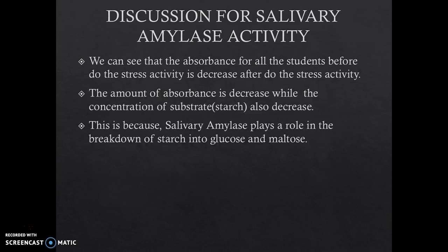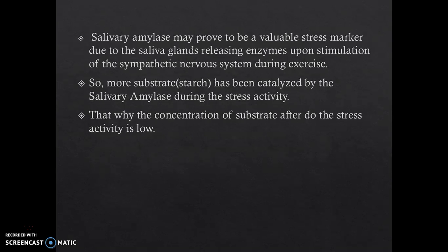So, the discussion for this activity: we can see that the absorbance for all the students before the stress activity is decreased after the stress activity. The amount of absorbance decreased while the concentration of substrate, starch, also decreased. This is because salivary amylase plays a role in the breakdown of starch into glucose and maltose.